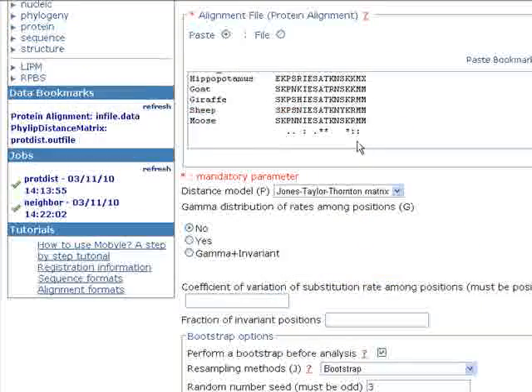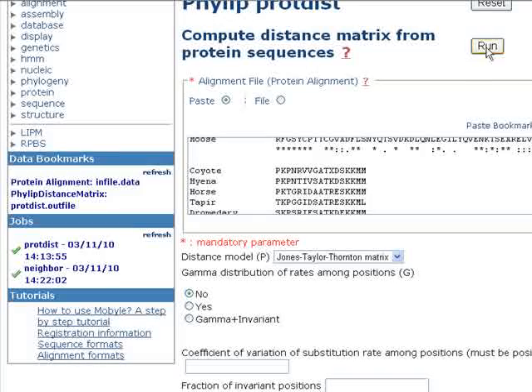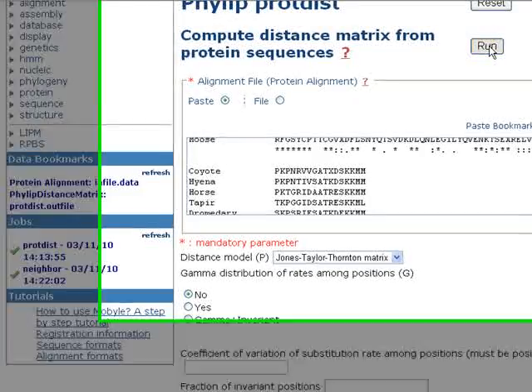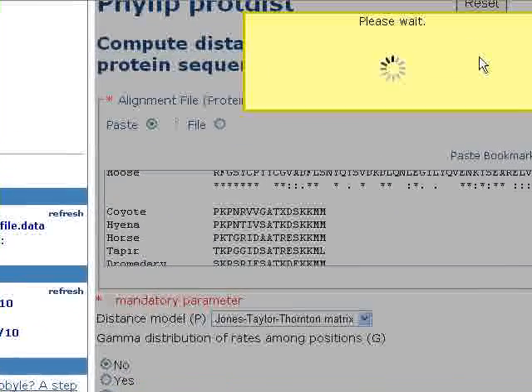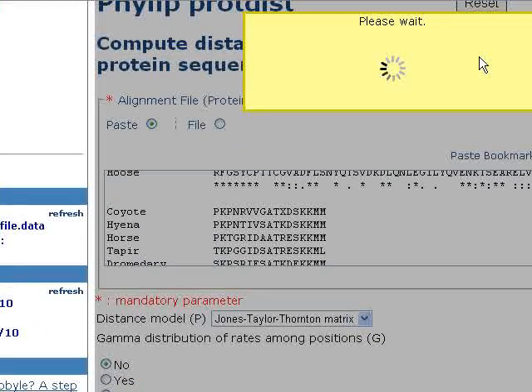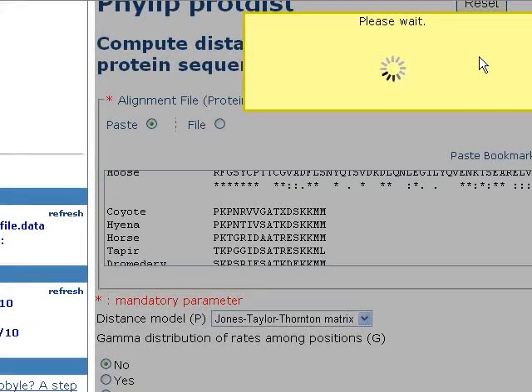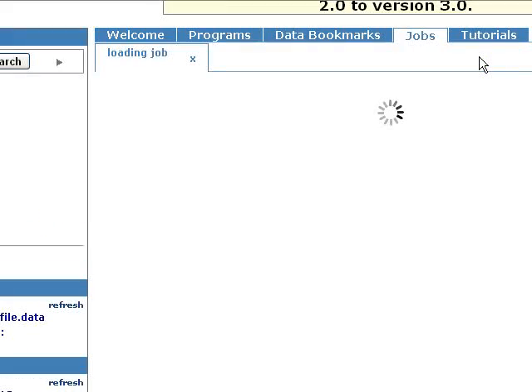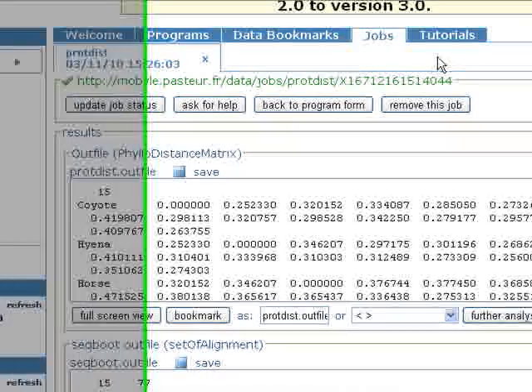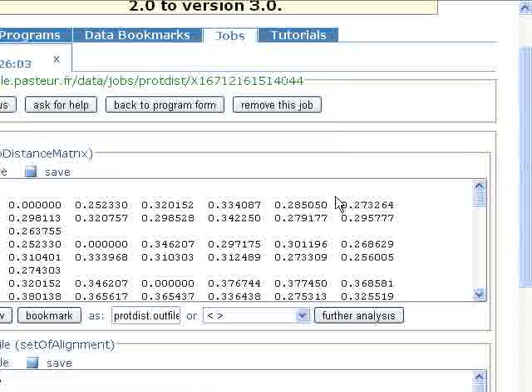Click on run here and wait for the result page to appear. So this is our first result page.